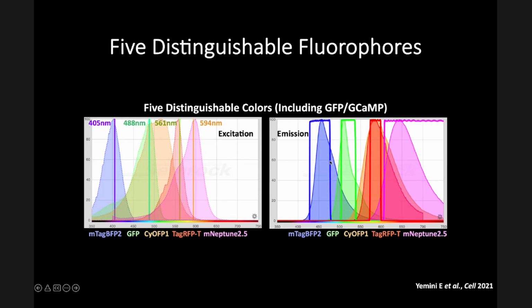And the key thing here is that I don't want to get into too much detail, but there's this factor of basically finding fluorophores that work with filter sets that exist and are being sold. It's not that easy. And ultimately, the solutions to the problem are really constrained. But I found 4 fluorophores that work with GFP and GCaMP, for which we have filters that can distinguish them, and they're available from various companies. And so every microscope works with this technique, and you just order these filters.